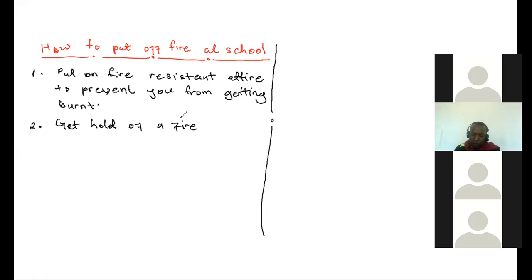And if you get your fire extinguisher, you have to immediately pull out the pin.